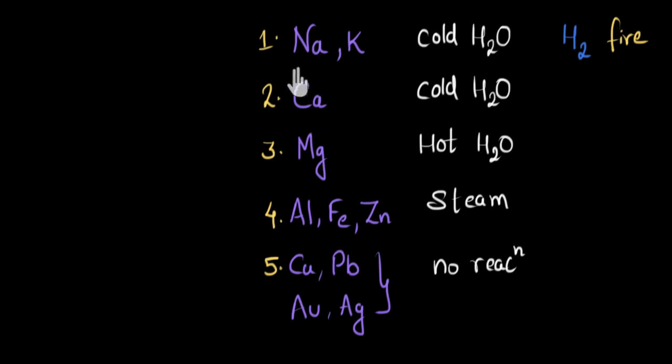So we saw that sodium and potassium, they even reacted with cold water, and the hydrogen gas that was being released was set on fire because of the immense amount of heat being released. At second, we had calcium, which also reacted with cold water, but there was no fire and the hydrogen gas was bubbling out. Thirdly, we have magnesium, which reacts only with hot water, not with cold water.